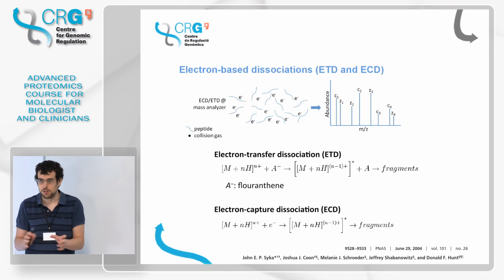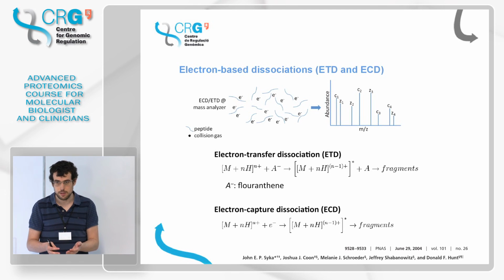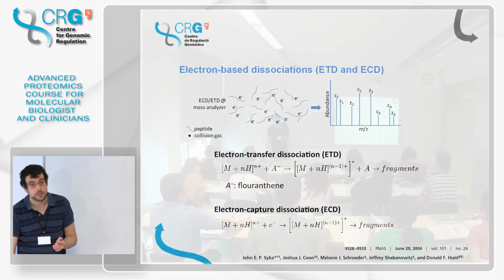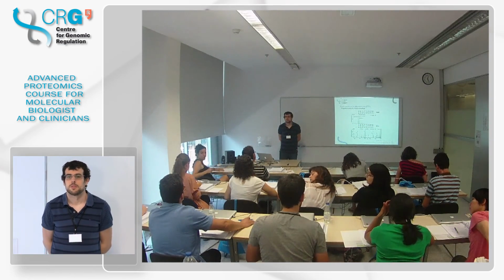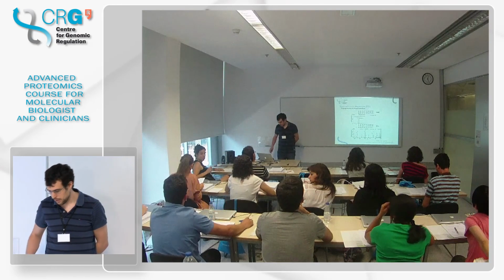But this is something that one has to take into account when interpreting MS2 spectra, but once one knows, this is quite simple. So one point I don't understand, why is it only fragmented between the peptide bond and not other parts of the molecule?